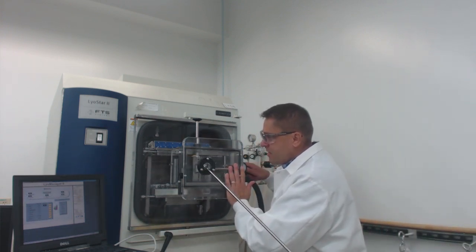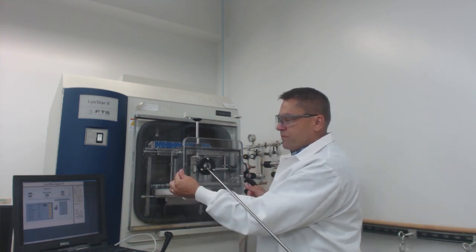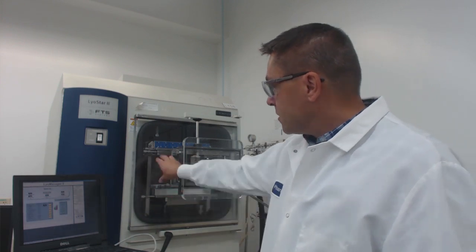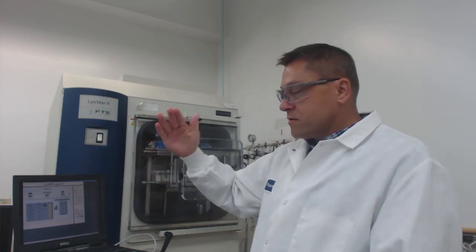At the end of the process, it's your choice now whether you want to seal under vacuum or not. Sealing under vacuum means that we make sure there's still a vacuum in there when we compress our shelves to seal the stoppers. That's how the stoppers are sealed. The shelf is raised using a button until the vials make contact with the shelf above and they're pressed to seal the stoppers.